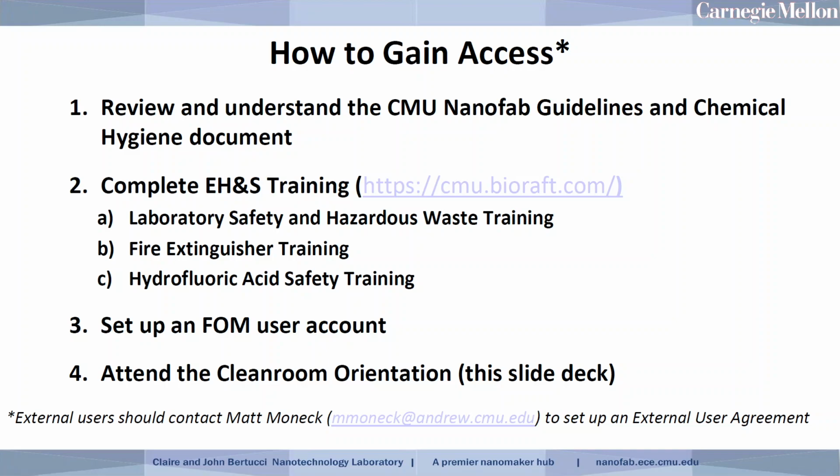First, you'll want to review and understand the Nanofab guidelines document and the chemical hygiene document. These documents contain a lot of information about the lab, how we operate, and how we handle chemicals.